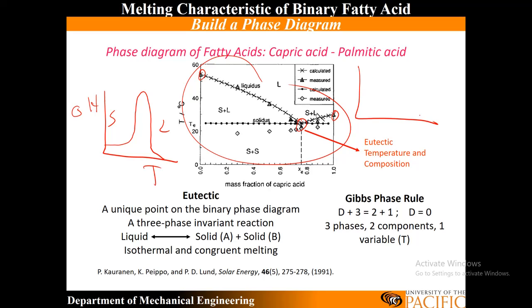But if I see multiple peaks, so let's say I see something like this, and then if I see 4 peaks, well, at low temperatures, what am I? On this side, I'm a solid. I'm a liquid here. So I know this is my solidus temperature. This is my liquidus temperature. And these two are some other type of intermediate temperature. So some unknowns, again, could relate to a peritectoid or eutectoid or some type of intermediate temperature 1, intermediate temperature 2. So different kinds of components here.